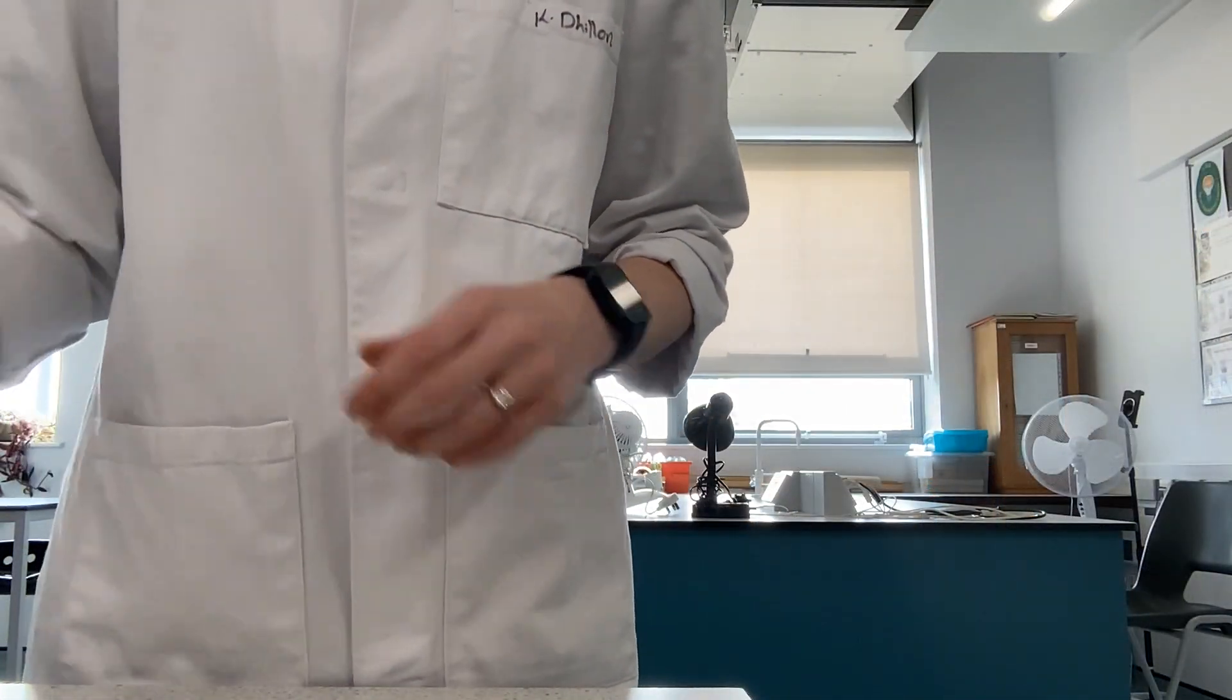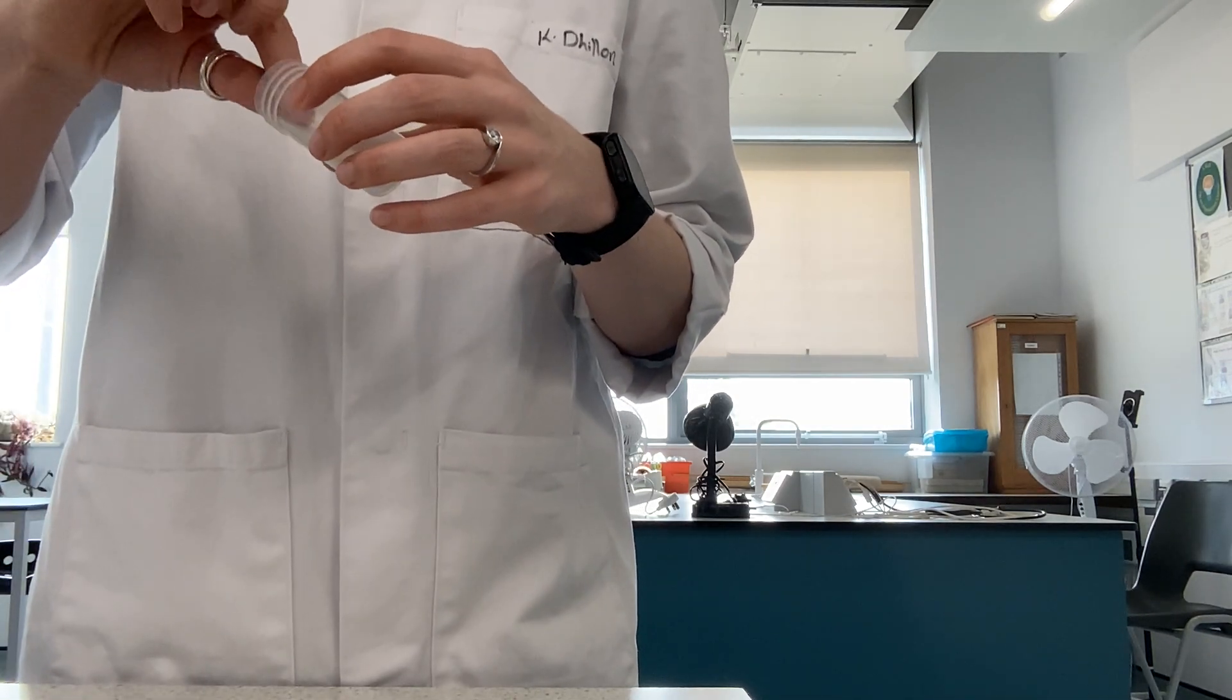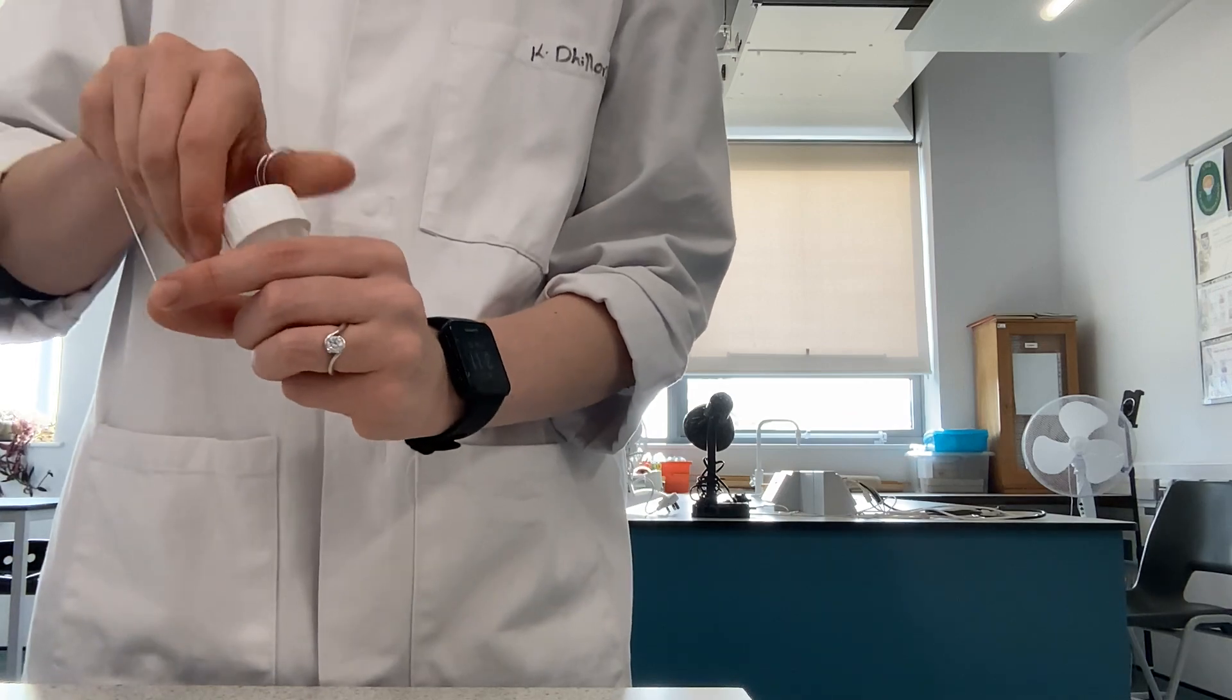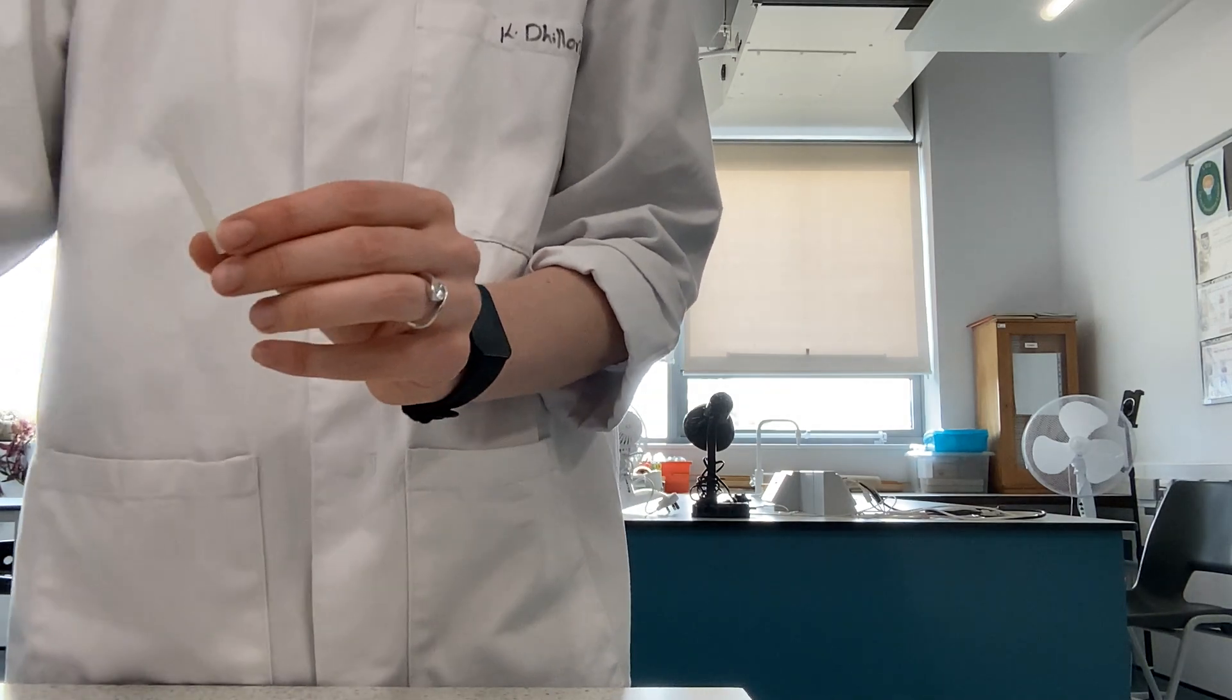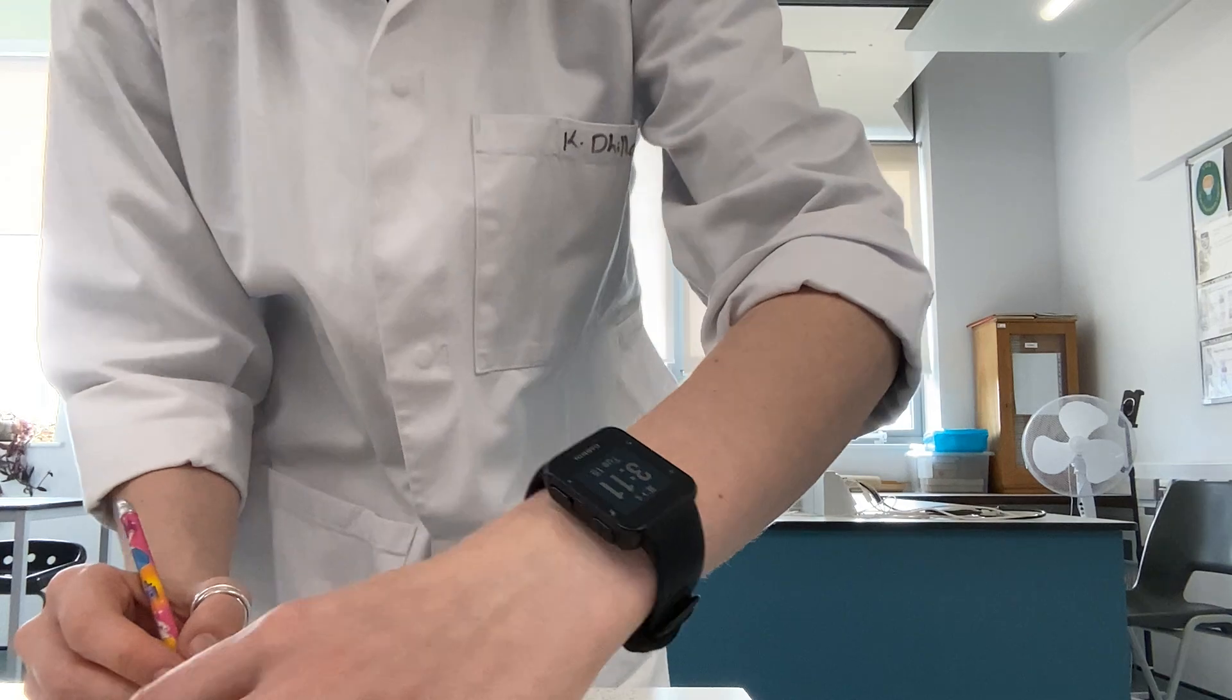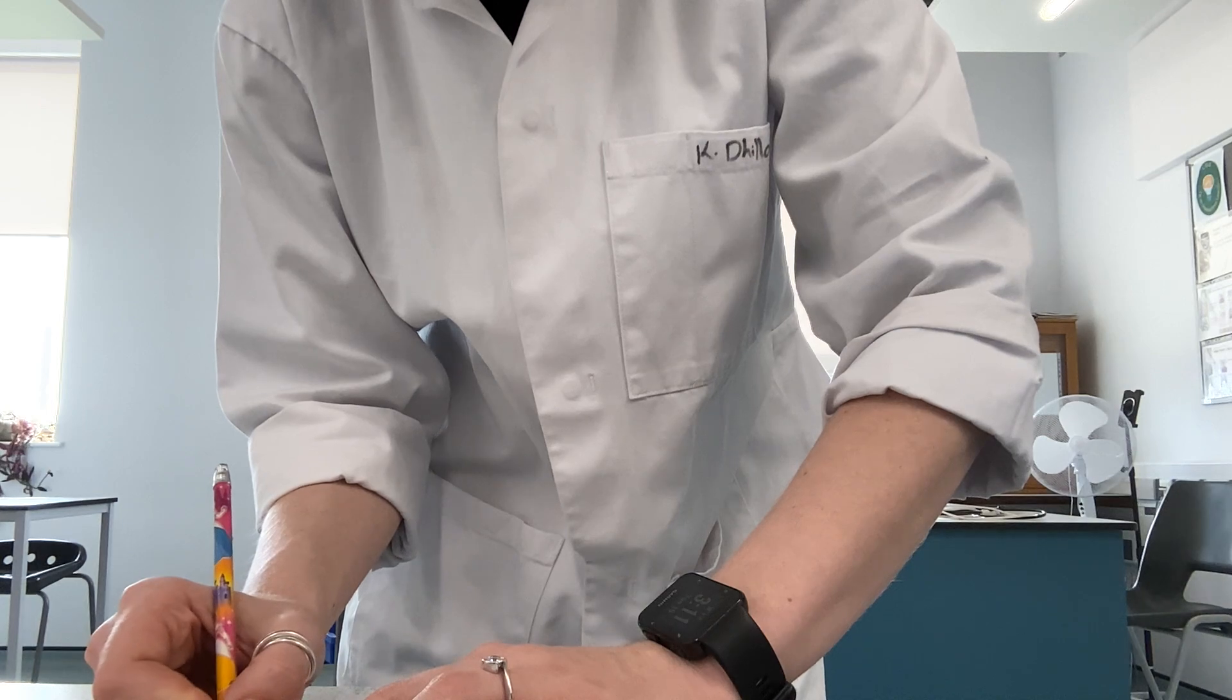What we'll now do is draw a pencil line onto our TLC plate. We need to very carefully get our TLC plate. What I will do is draw a pencil line along the bottom, and we always do a pencil line so that it does not run with the liquid. This will then be our starting point. Using a ruler, we'll draw our pencil line across the bottom.